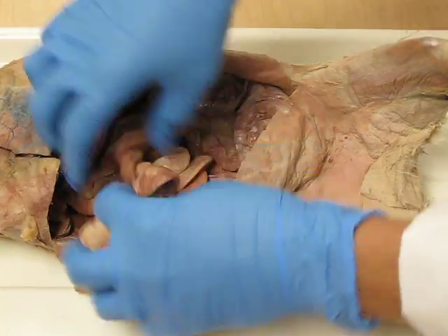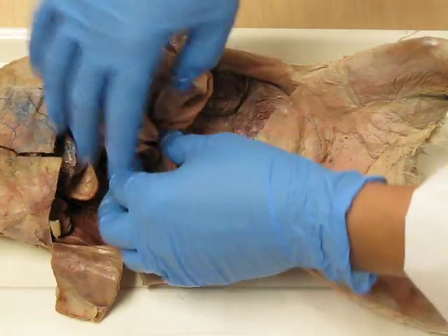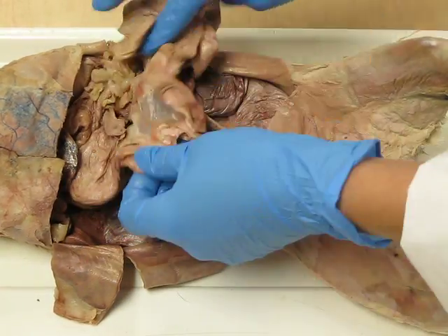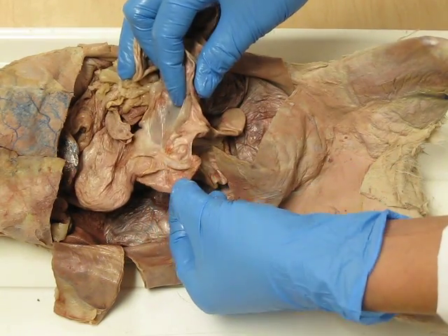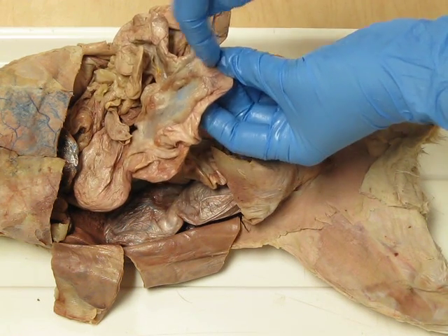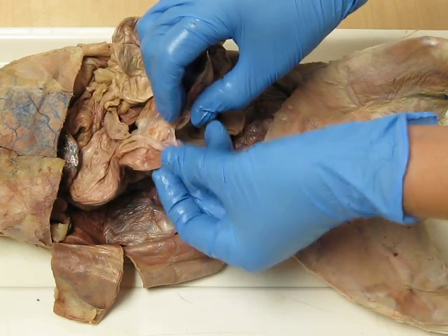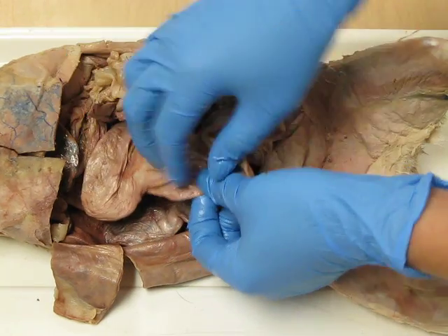So if we just find where the large intestine begins, there we go. And the small intestine ends, then you know that this is ileum. So here's the cecum, and this is the end of the small intestine. So there's a pin here, ileum. Now the ileocecal valve is where the small intestine ends and the cecum begins. There's a thickened ring of smooth muscle there as well, ileocecal valve. Okay, then we have the colon.